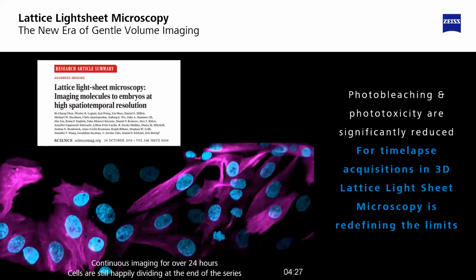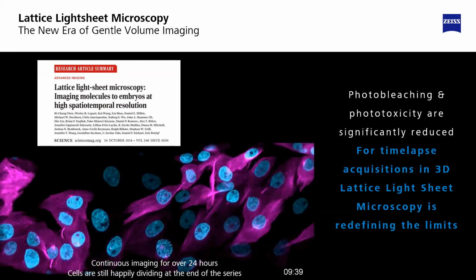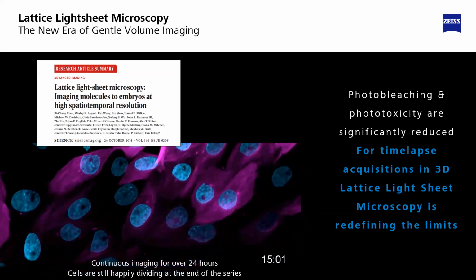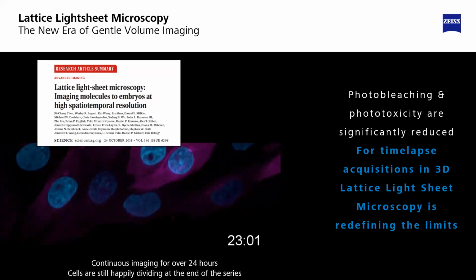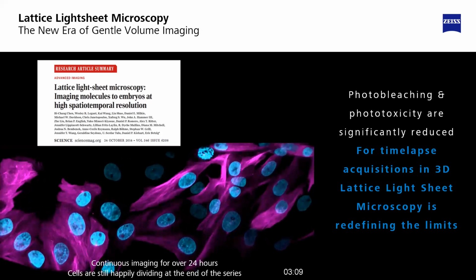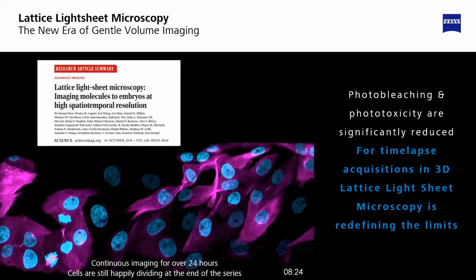I'm aware that you guys have lattice light sheet technology on campus already, so some or maybe all of you are going to be familiar with the principles of lattice light sheet, but I do want to spend a fair amount of time discussing the lattice light sheet technology itself, what that entails, and how Zeiss is approaching lattice light sheet as a modality, an imaging modality.